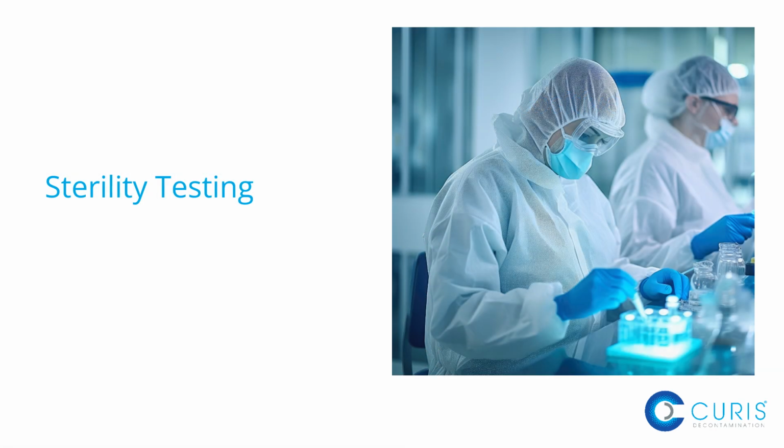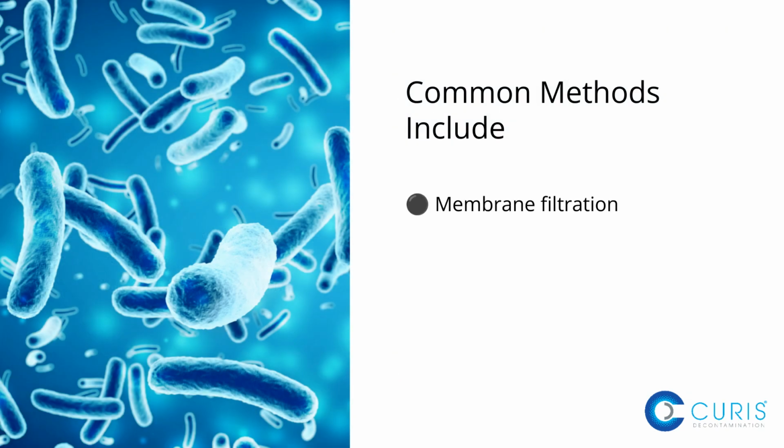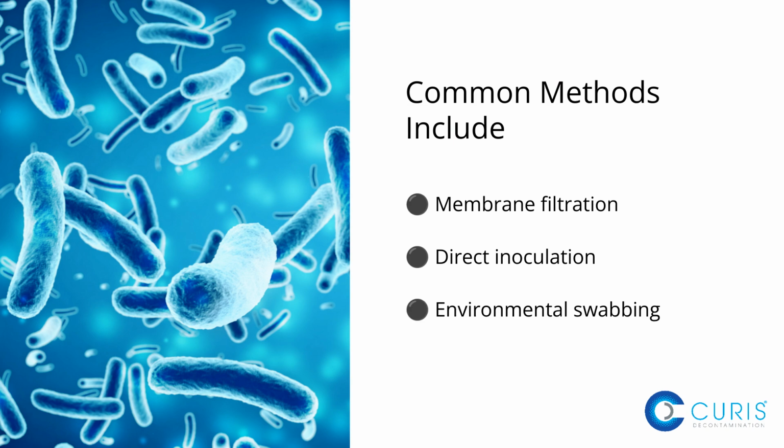Understanding why false positives occur and how to prevent them is essential. Sterility testing goes beyond confirming the absence of microorganisms. It's a controlled, highly sensitive process designed to detect even trace contamination. Common methods include membrane filtration, direct inoculation, environmental swabbing, and biological indicators. In highly regulated environments, even minor procedural lapses during sample preparation, handling, or incubation can lead to misleading results. That's why mastering the fundamentals is the first step toward reducing false positives.